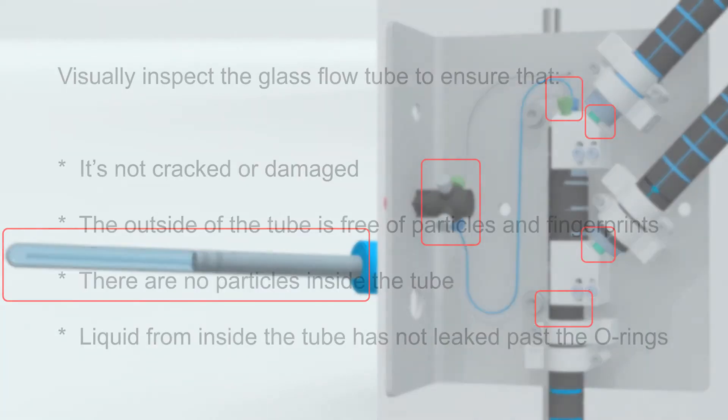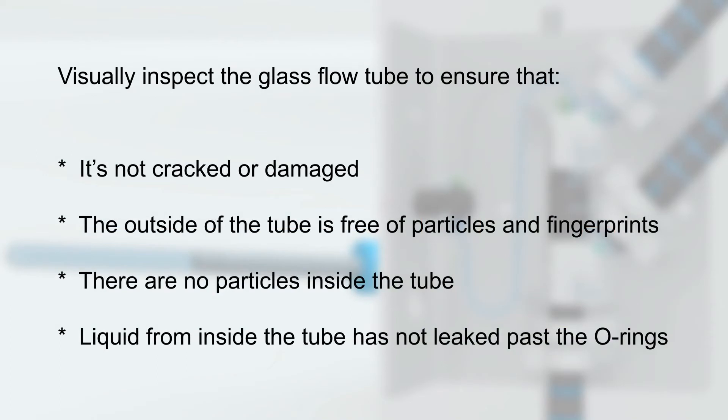Replace the glass flow tube and/or the O-rings if necessary. Then visually inspect the glass flow tube to ensure that it is not cracked or damaged, the outside of the tube is free of particles and fingerprints, there are no particles inside the tube, and liquid from inside the tube has not leaked past the O-rings.